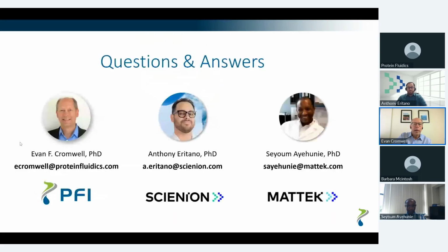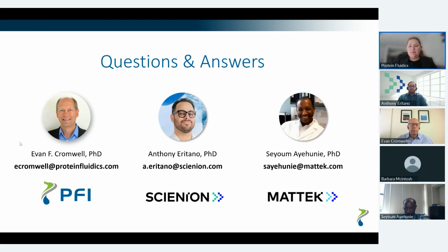So with that, let's open up for questions and answers. Emma, would you like to? Yes. So we have a couple of questions. First, this is for Anthony. What kind of media is compatible with the spheroONE?